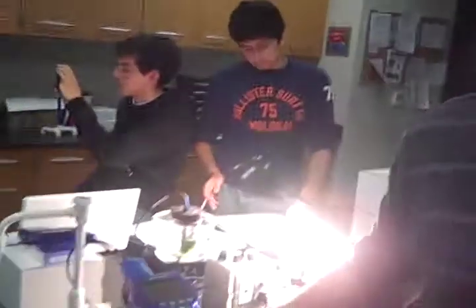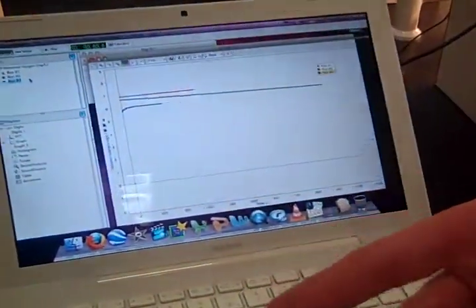Alright, so the results we got here were not what we predicted our hypothesis would be, but we think we may have found out the reason why. From looking at another group's data who had a temperature probe in it, the temperature steadily increased as the light was put in there, and we did a little research and we found that oxygen dissolves less in warmer water. So as the water was getting warmer, the amount of oxygen that could dissolve in the water was decreased, so that offset the amount of oxygen put in by photosynthesis. Yeah, that's what we think happened in our graph.